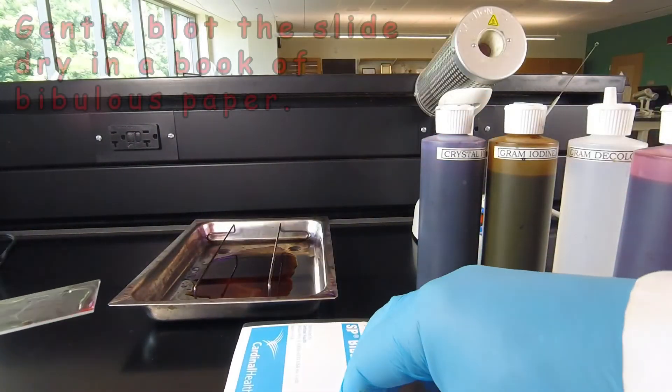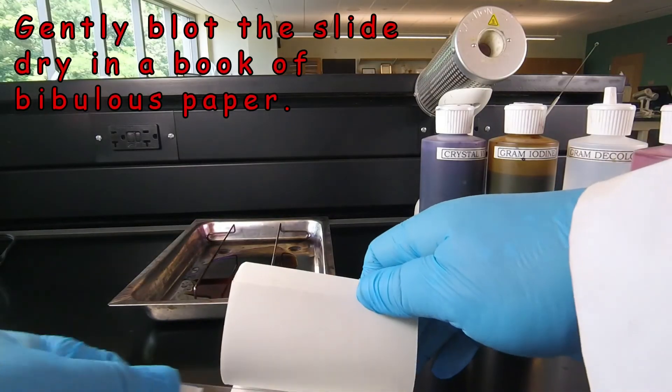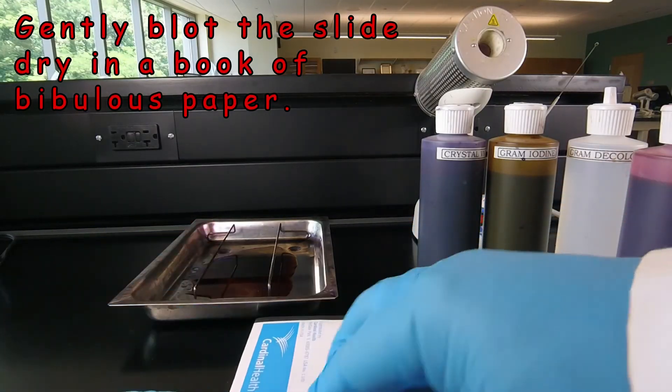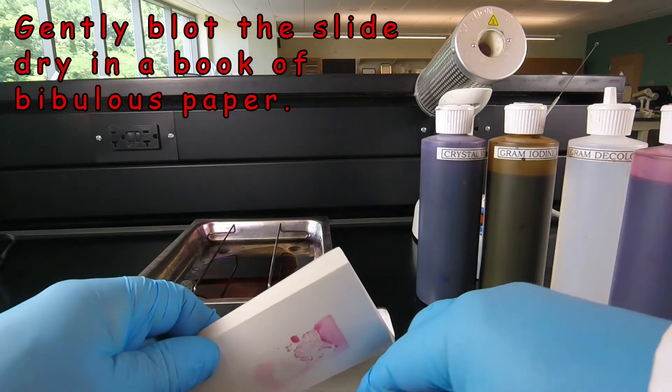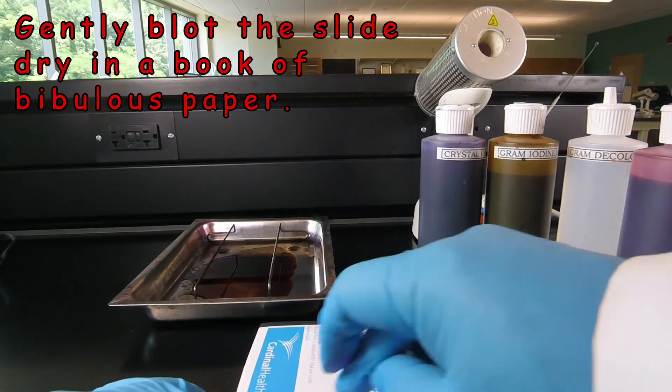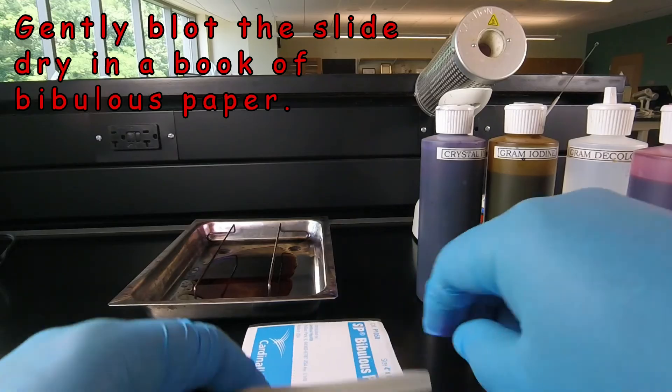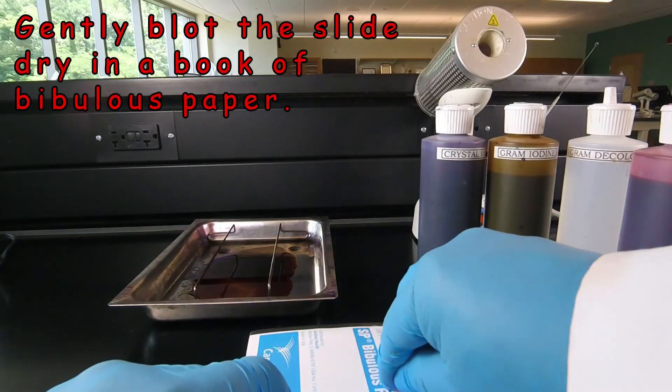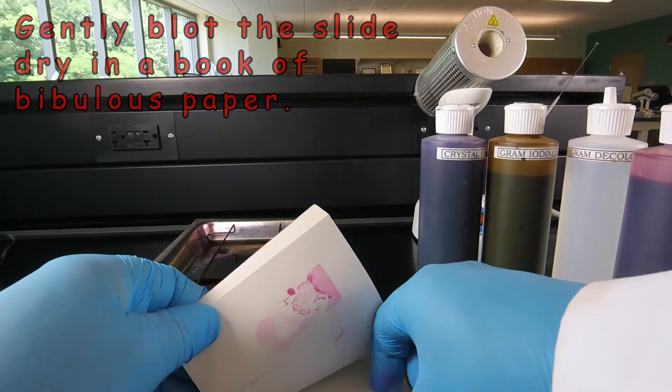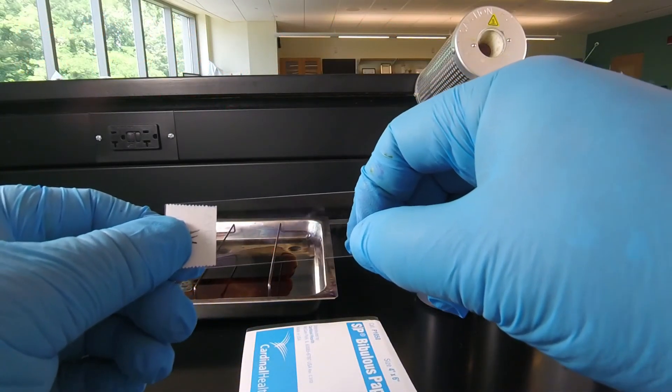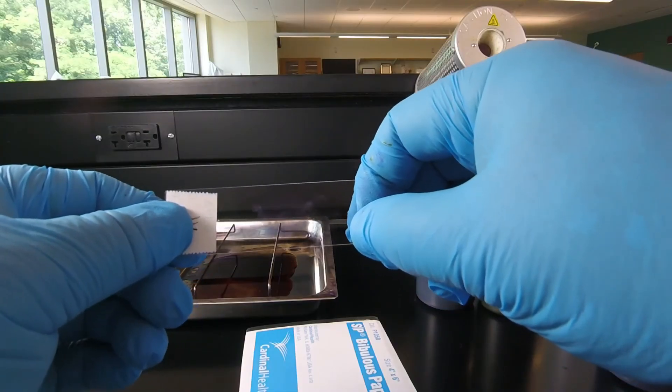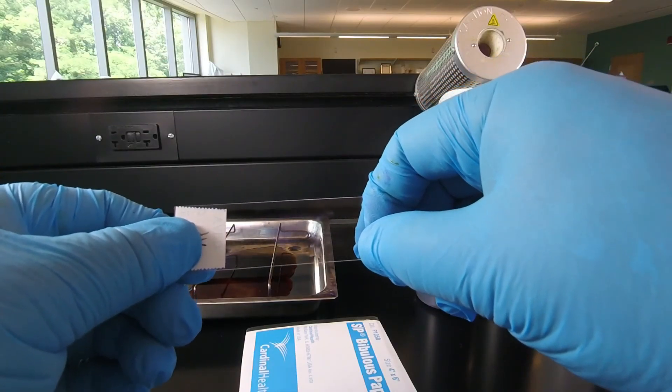We take our book of bibulous paper and put the slide in the book. We gently rub it. Don't push too hard or you could break the slide. We move the slide around several times while gently rubbing the slide. At that point, the slide is dry. We're ready to put on our immersion oil and observe under a thousand magnification.